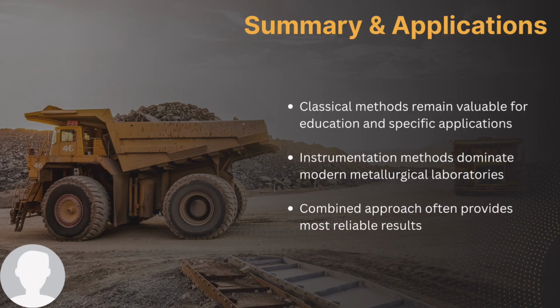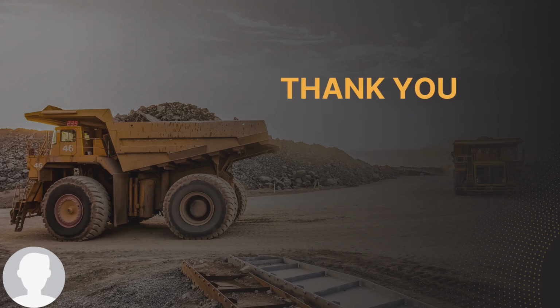In conclusion, classical methods remain vital for educational baselines and standard verification work. However, automated instrumental techniques undeniably dominate modern metallurgical laboratories. In practice, a combined approach leveraging both methodologies often yields the most reliable, cross-verified results in advanced metallurgical engineering.